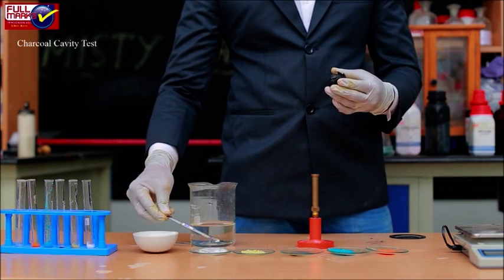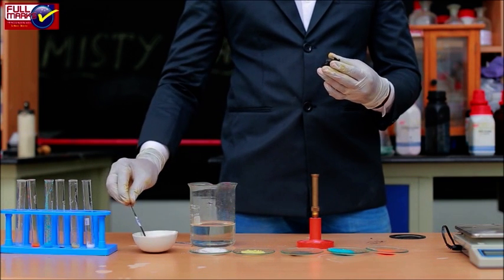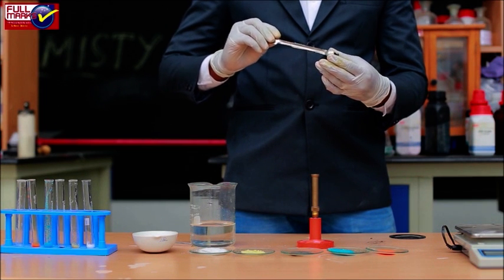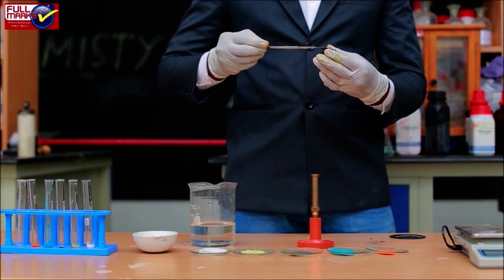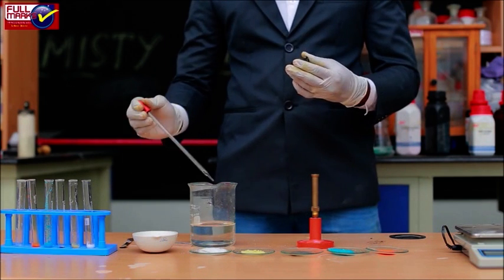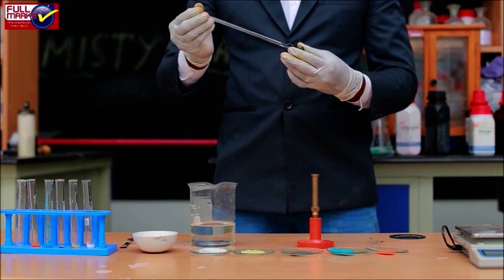Charcoal cavity test: This test is divided into two parts, which are reduction test and cobalt nitrate test. This test is based on the premise that when metallic carbonates are heated in a charcoal cavity, they decompose to give corresponding oxides. The oxide is obtained as colored incrustation or residue in the charcoal cavity.